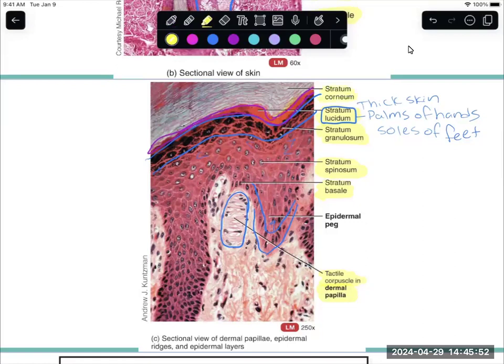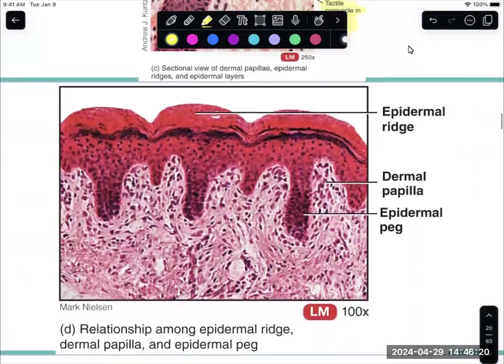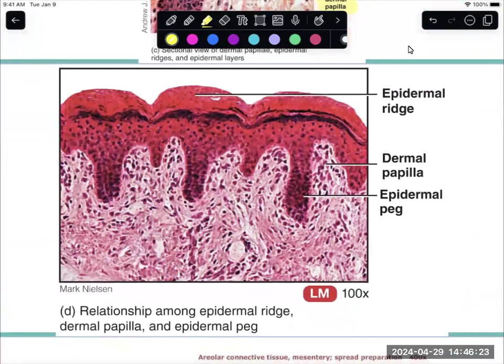The layer of skin that we can see when you look at your hand, your arm, your legs, is the stratum corneum. This is 30 to 60 layers of cells deep, and these cells are all dead. The cells die at the stratum granulosum just because they're getting too far away from nutrients. At this point, these cells are just working their way up until that top layer gets sloughed off. Here we can see that dermal papilla, which is where that dermis goes up into that epidermis.